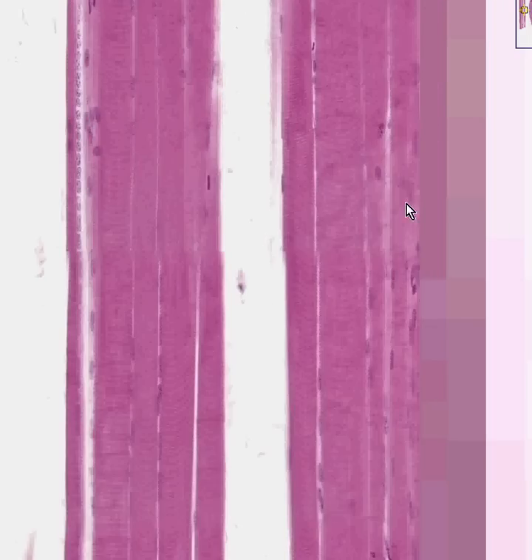Technically, if you cut one of these nuclei tangentially with respect to the fiber it might look like it was in the middle of the fiber, but in reality that's just a geometric artifact. In true voluntary skeletal striated muscle the nuclei are all at the periphery. You can identify the striations better from longitudinal cuts with respect to the axis of the fiber, and identify where the nuclei are better by doing cross or axial sections.